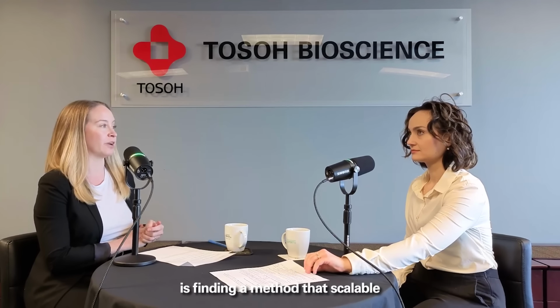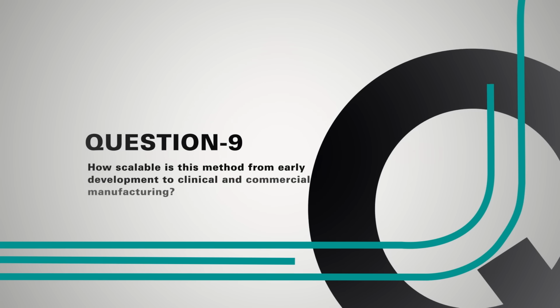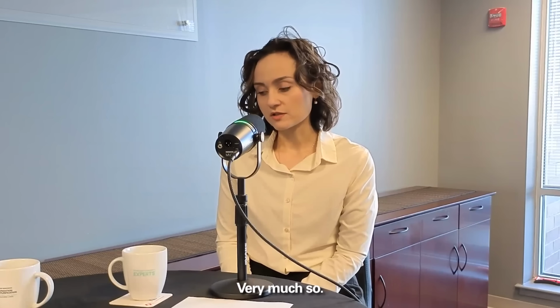That's so exciting. So let's talk about the broader implications of this new method for cell and gene therapy. In the beginning, we talked about how one of the biggest things is finding a method that's scalable. So, how scalable is this method? I imagine you probably started on 1 mL columns and scaled up a little bit. Is this scalable to clinical and commercial manufacturing? So absolutely, very much so.